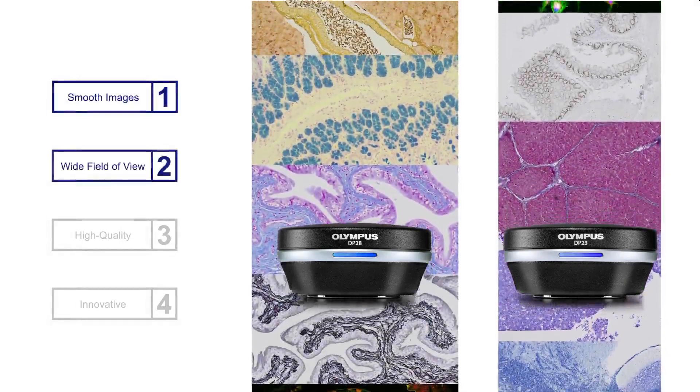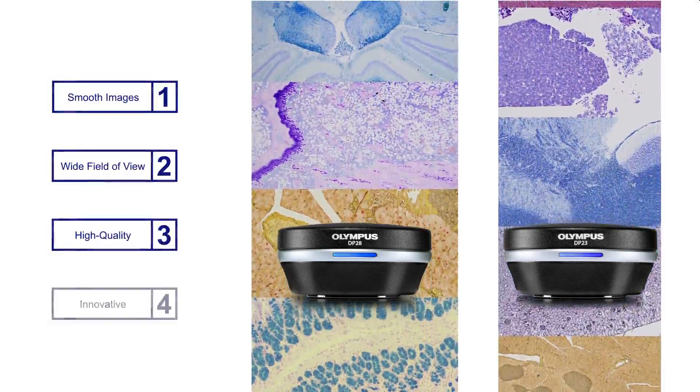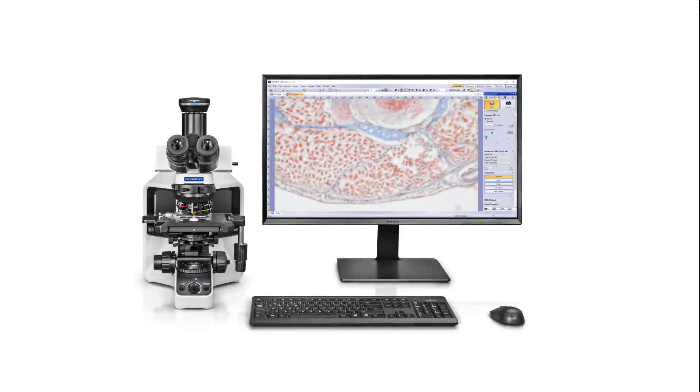Both cameras offer smooth, wide field of view, high-quality images with excellent color reproduction combined with innovative features, so you can stay comfortable looking at the screen rather than through your microscope's eyepieces.